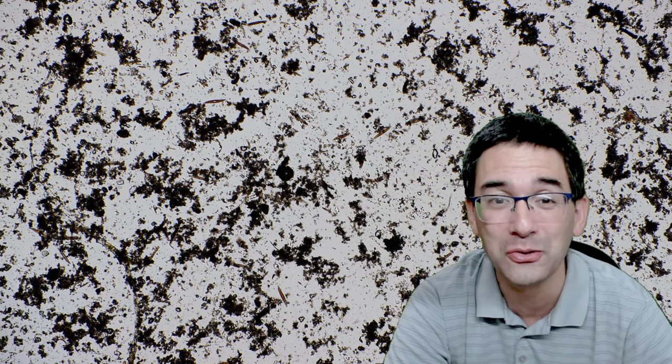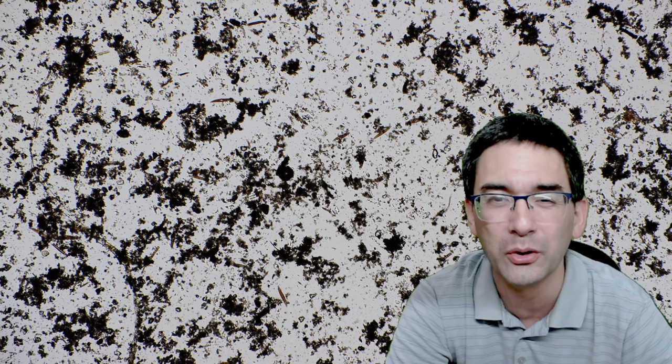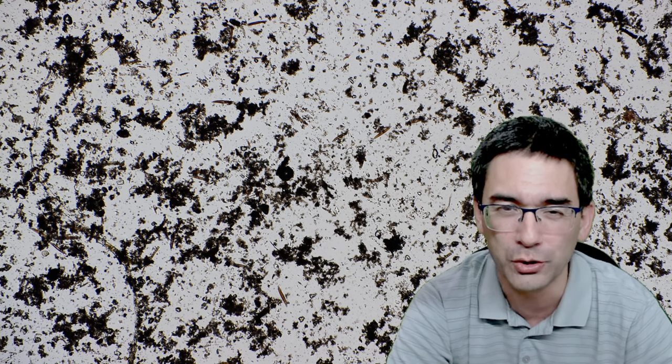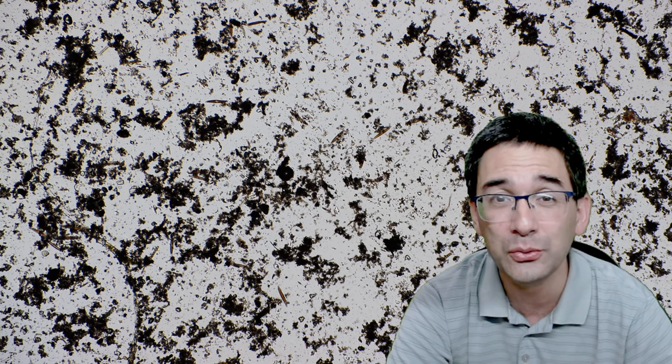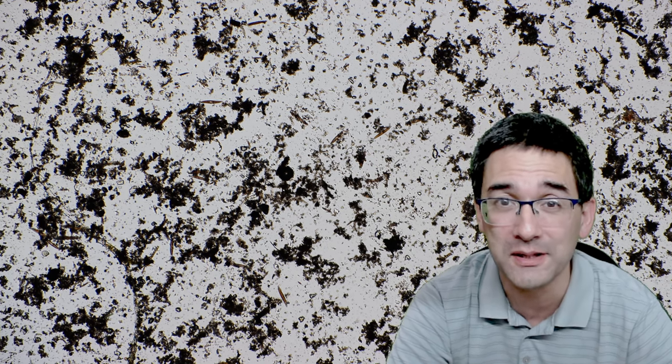And the disappointment, of course, was big. I just showed it to you. Not so much going on. If you look very carefully, there is a little bit of movement going on, but not so much really. And what I'm going to do now is I'm going to speed it up 20 times.